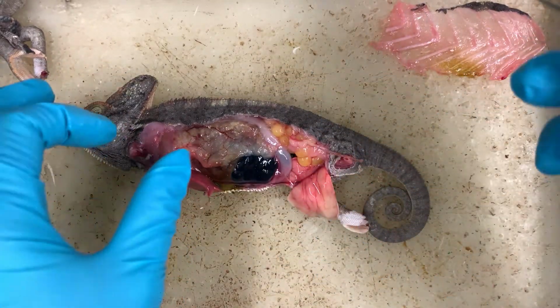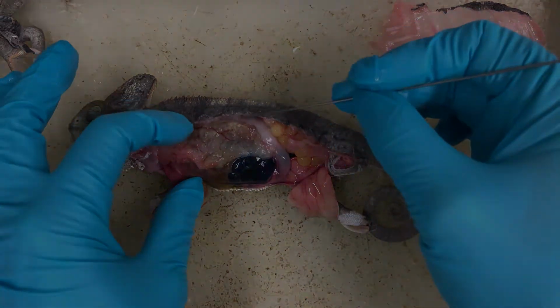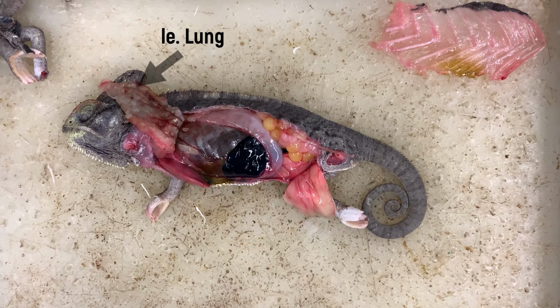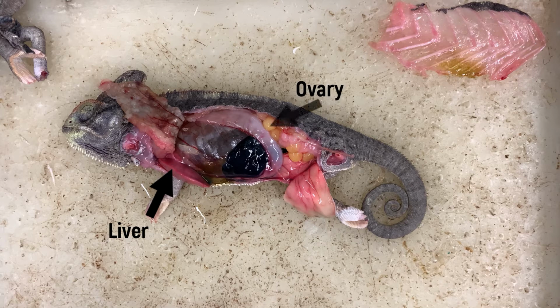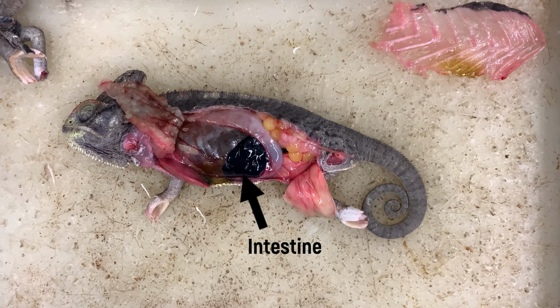The lung of the chameleon is large and can be used to inflate the body during threat displays. We can lift it forward to see the digestive system beneath. The liver is ventral and positioned to the right side of the body. The ovaries here are full of egg follicles. The gallbladder is slightly greenish. The intestine is dark and tightly bundled. The rectum runs ventral to the ovaries.